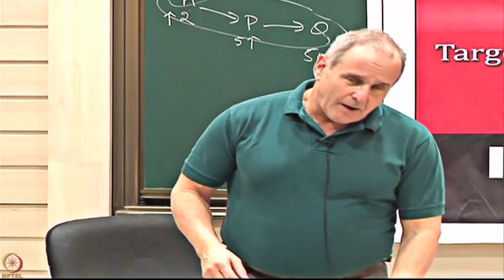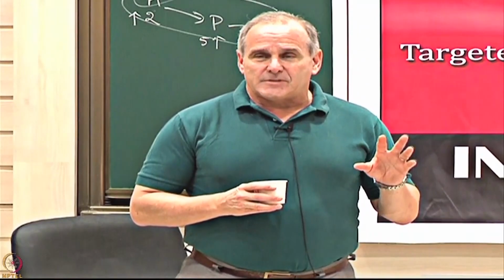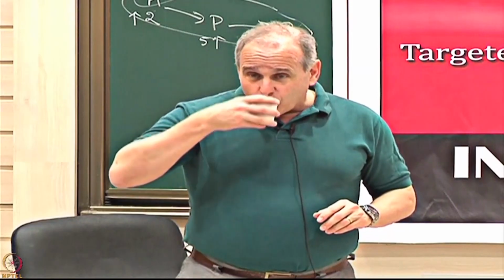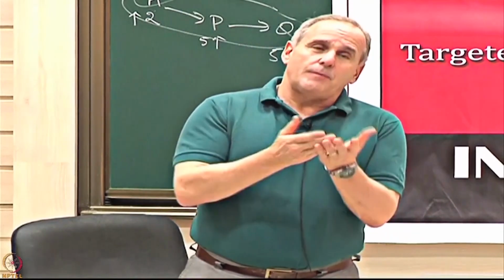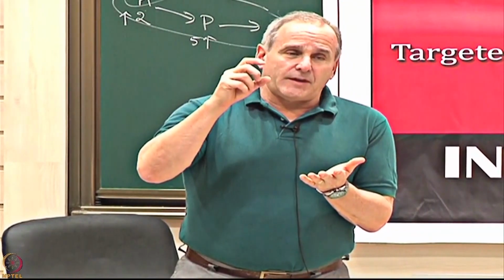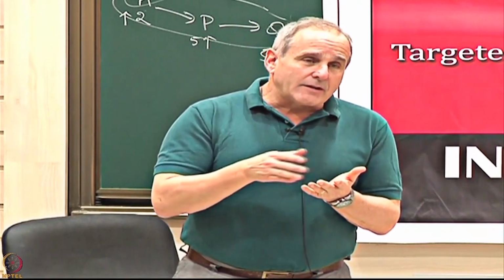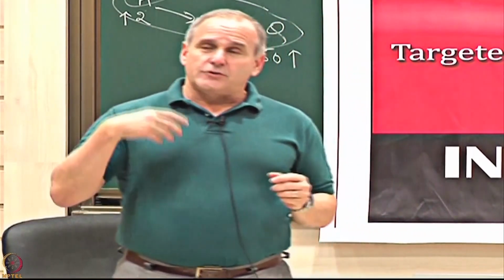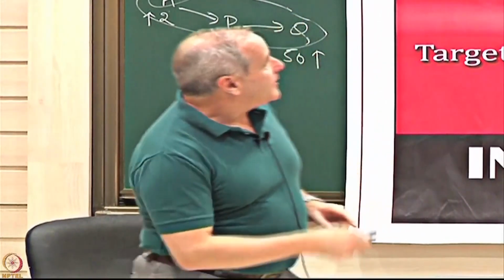So we had a very ambitious postdoc in the lab, Xiaobo Yu, and he wanted to see if he could use the protein array as a way of discovering what were the targets of these enzymes. The approach that he took was, the idea would be you print an array, you express the proteins, and you treat it with an AMPylator that will add the AMP group to the proteins. And then you come back later and try to determine which proteins had the AMP group on it. The initial approach that people thought would work would be you do this method, you have the AMP group, and you come in with an antibody that recognizes the AMP here.